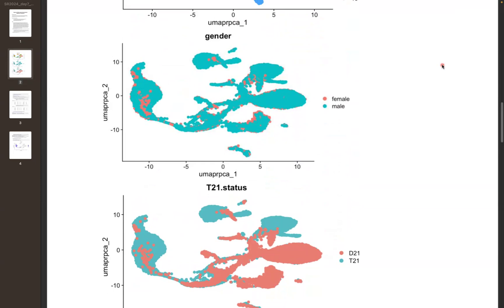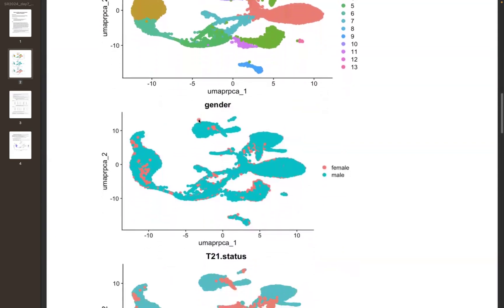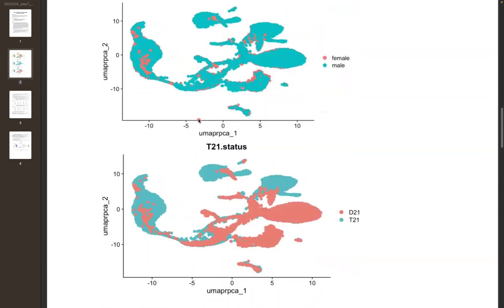We can color the cells by the metadata designations we assigned — for example, by gender, to see whether cells came from a male or female fetus. We can see that overall the effect of gender is relatively small relative to the effects of different cell types, which is ideally what we want to see. We want experiments integrating well across gender and other variables we don't want to directly assess. On the other hand, T21 versus D21 cells are segregating quite distinctly.